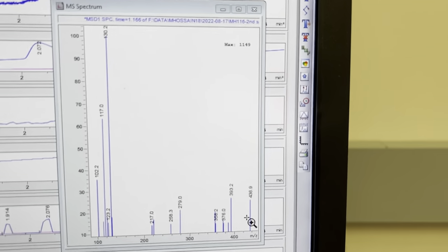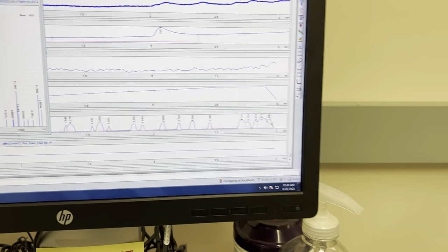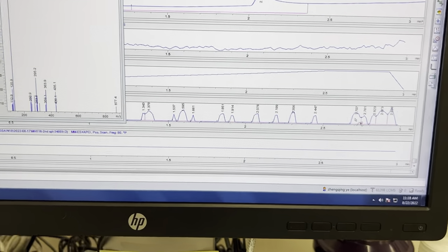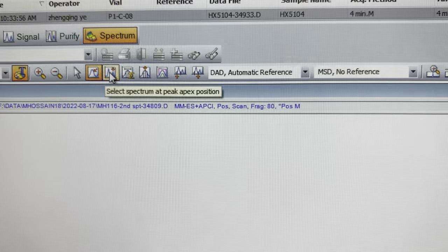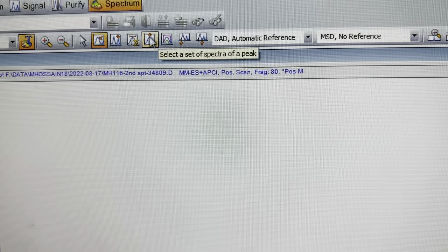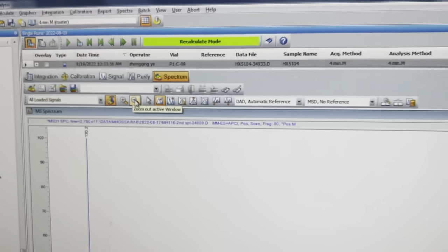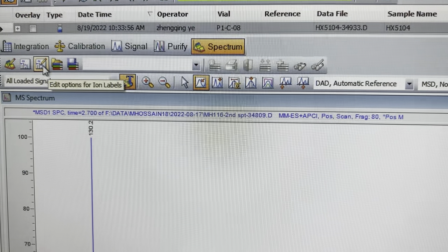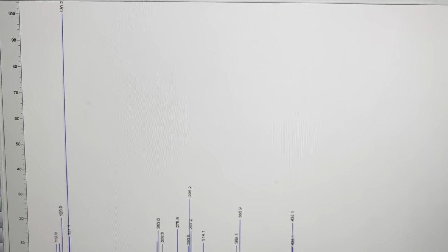You can individually click on those peaks and see the mass number. If your product is there, depending on the peak you can see your expected product. By this way you can do your LC-MS test — it is a qualitative test, not quantification, just to check your reaction or whether you have the product. LC-MS quantitation is more rigorous and research-based, requiring more techniques, validation, and strict standard operating procedures. In a future video I will show LC-MS analysis for drug-related analysis, metabolite quantification, and other analyses.